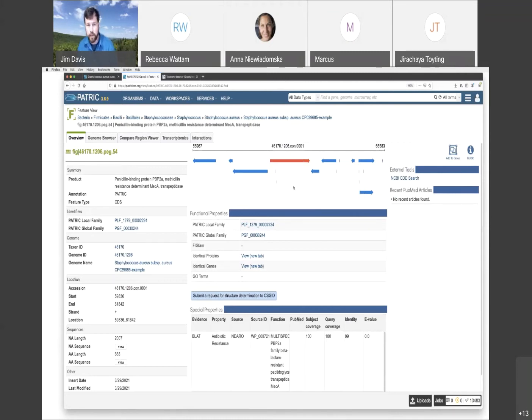And the machine learning algorithms, I won't get the mouse over here. Oh, there it is. Oh. There we go. Oh. We'll find it this way.